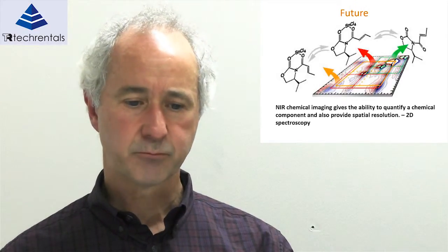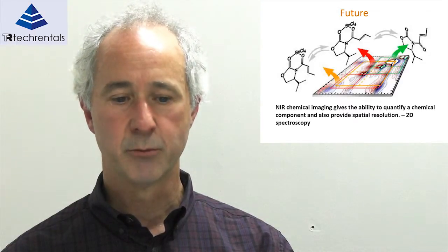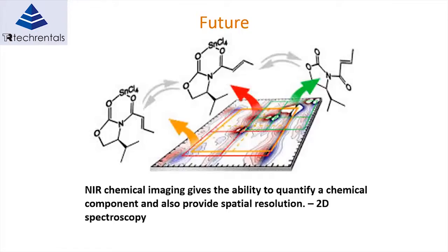For the future, this is what's with the multispectral imaging cameras now. They're really a combination of a near-infrared spectrometer and a two-dimensional video camera. So instead of each pixel representing red, green, or blue as a camera typically does, each pixel will have 250 elements or 128 elements or whatever associated with it, and each element will indicate a wavelength range.